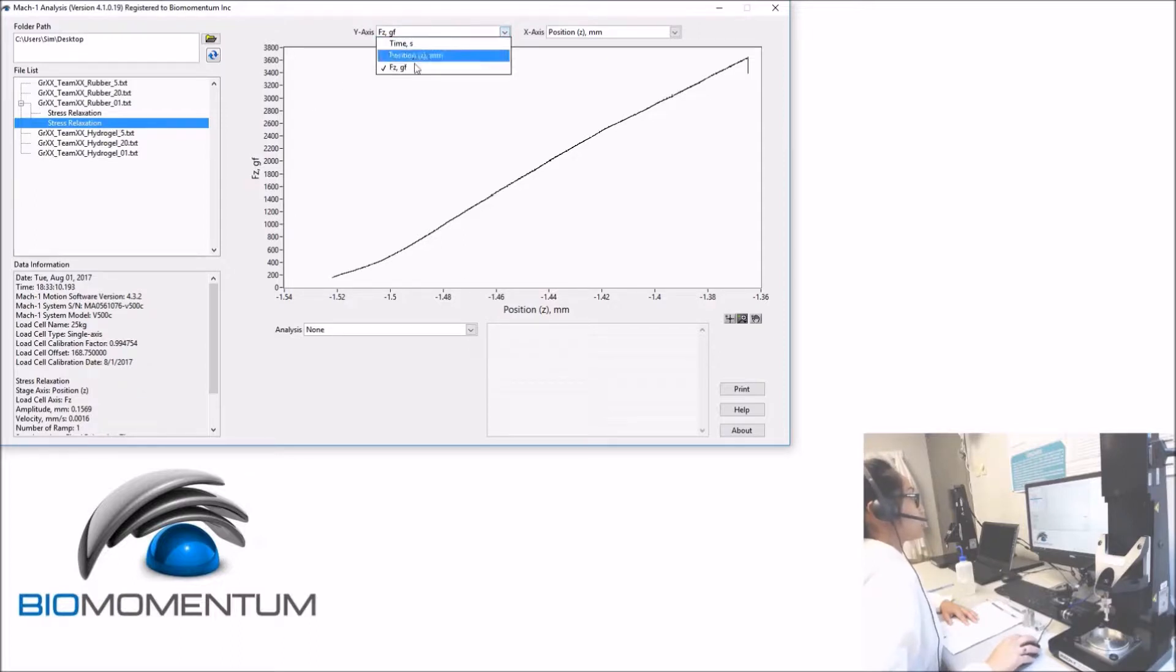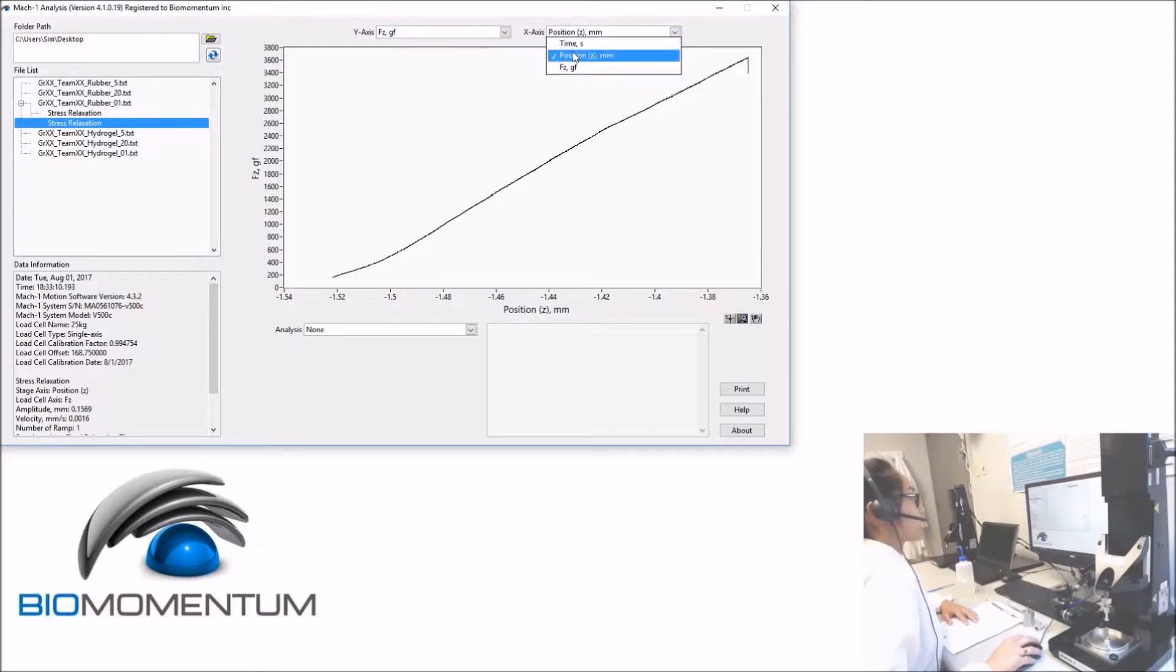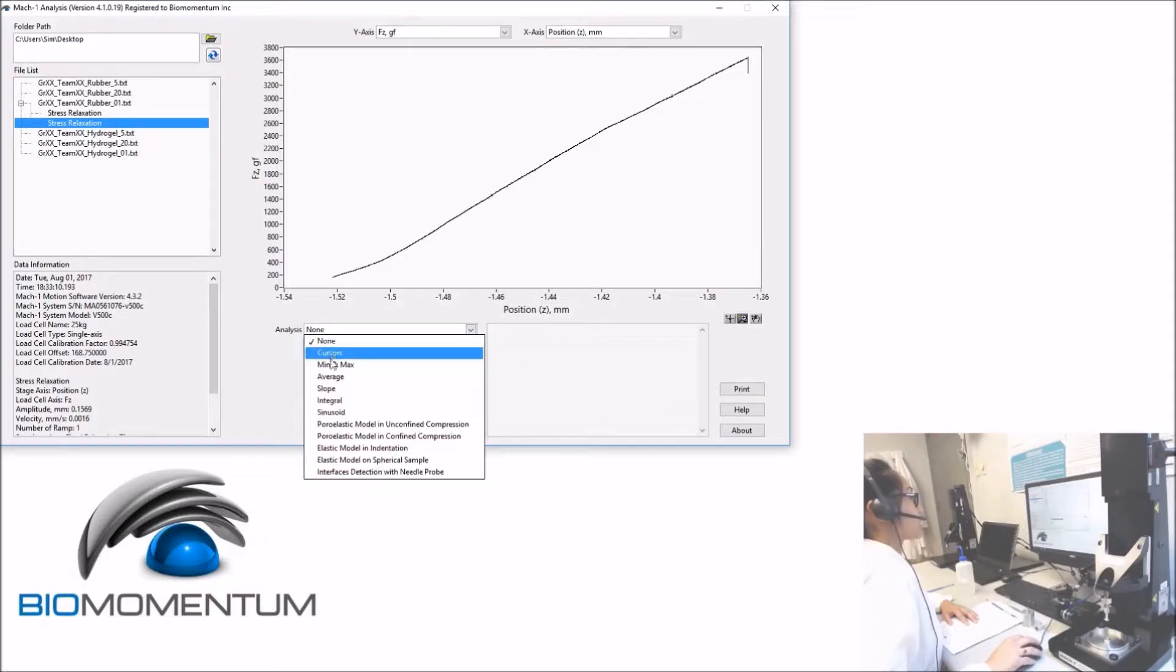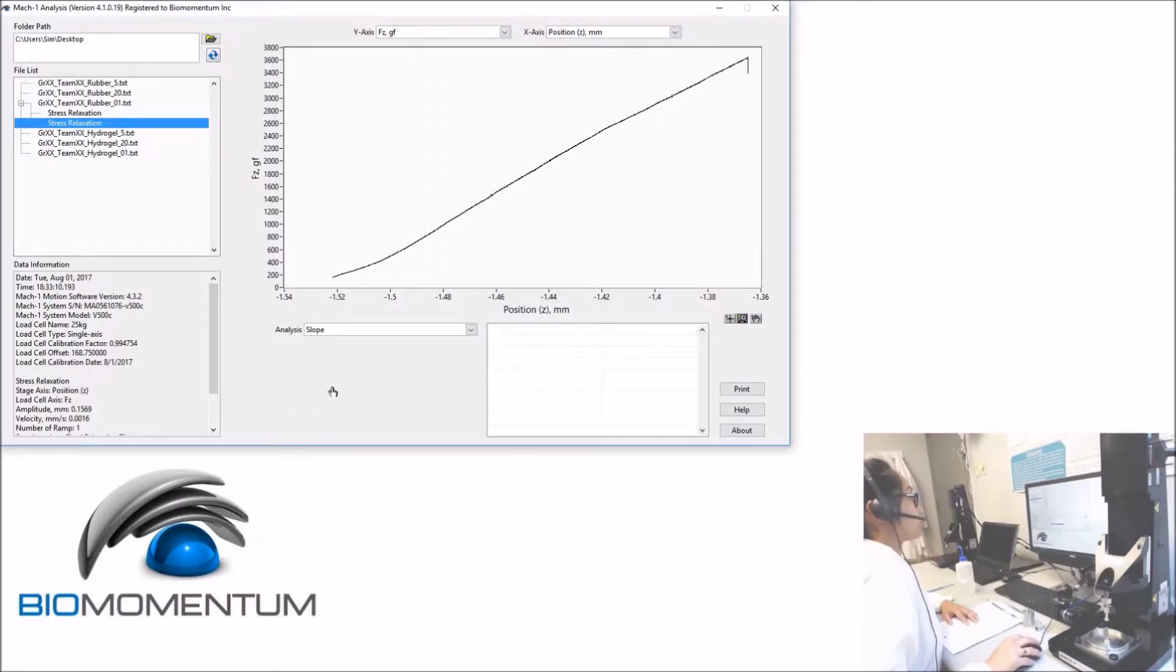Choose the force as the vertical axis and the position as the horizontal axis. From the analysis drop-down menu list, select slope.